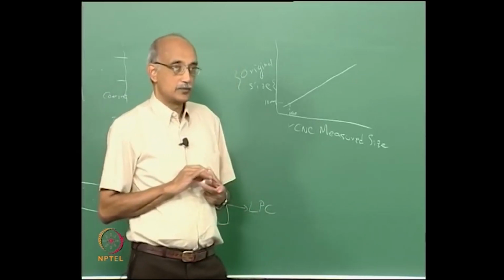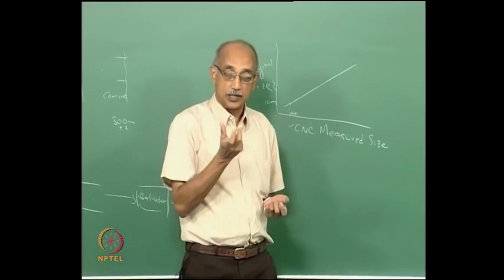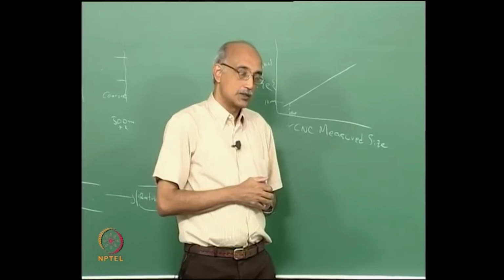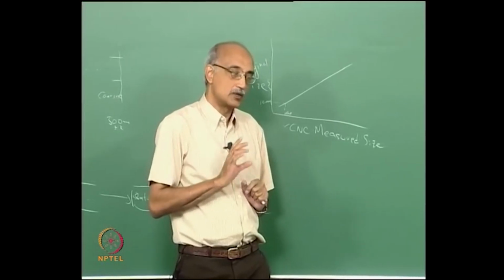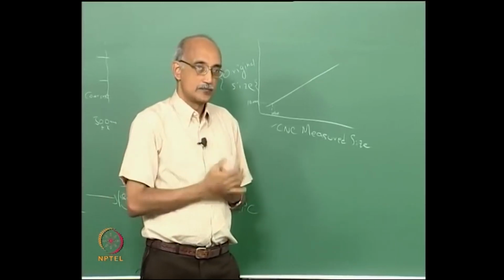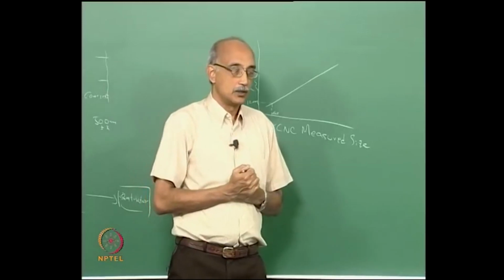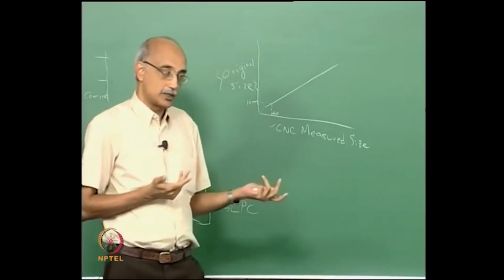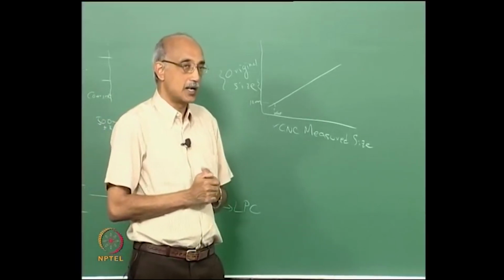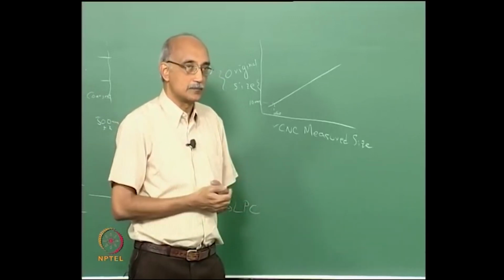Theoretically, sure. The basic assumption is still going to be regarding the shape, because most of our calculations are still based on sphericity. So the error in your theoretical analysis will very much depend on how spherical the particles are. The closer to sphericity in shape, the better your theoretical calculations would be. But if you use the experimental method of calibration, then your accuracy is very good, but it's not easy to do, and it's not a very good use of either your time or the instrument's time.